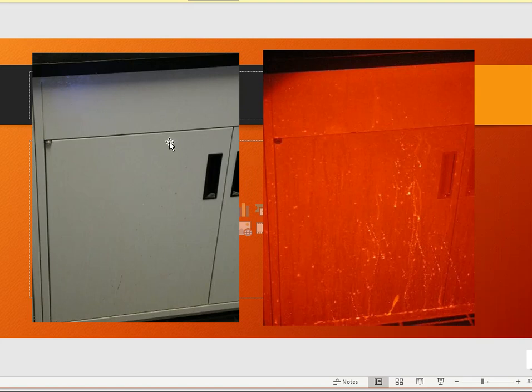Here's a lab desk, basically, or a cabinet area. It's metal. It's pretty sleek, non-porous surface. But here, when we turn the light on, you can see all of these drips and nasty things that are coming down off the surface of the lab counter door. This, again, is maybe not blood. It's probably not body fluid. At least I hope it's not. But this is just another presence of a contaminant. And again, those are typically cleaners and soaps and other things that are very common in those products.